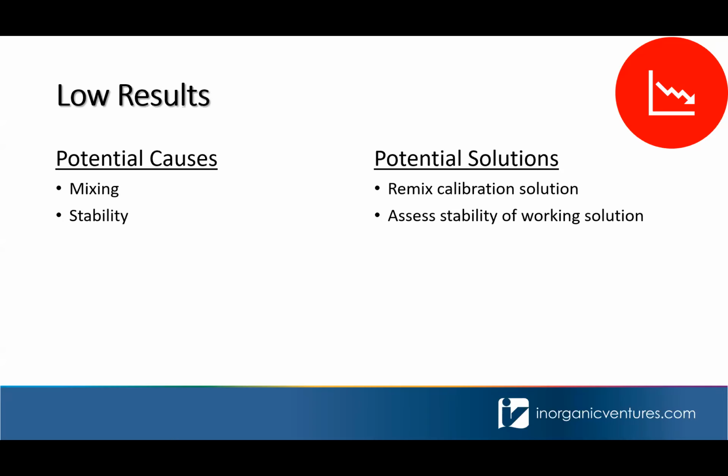With stability, not all of your analytes will show up low. If you're having a stability issue, one way to hone in on the fact that it could be a stability issue is if one or a group of elements are low.